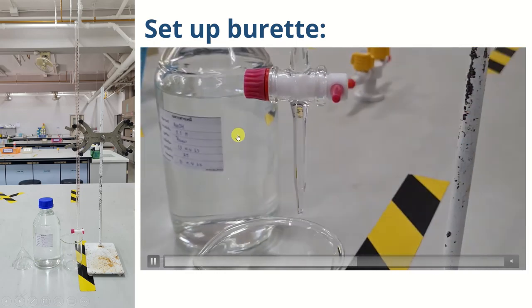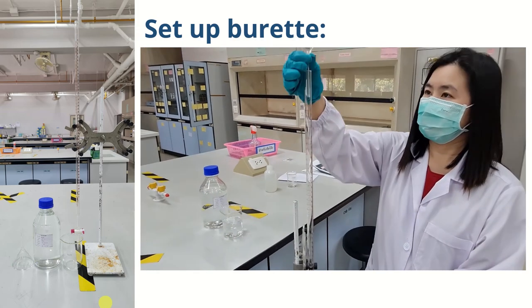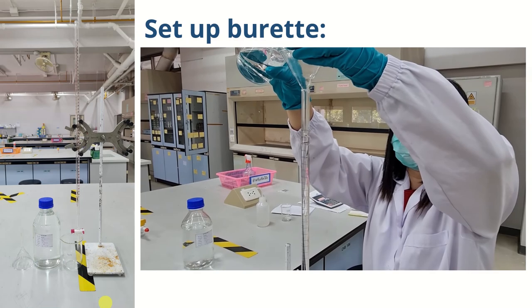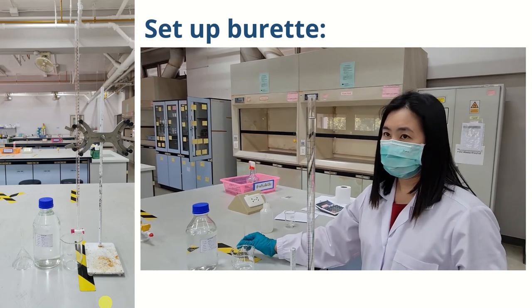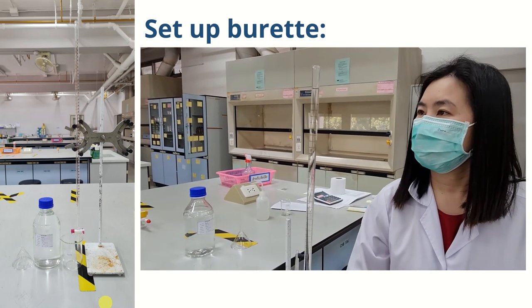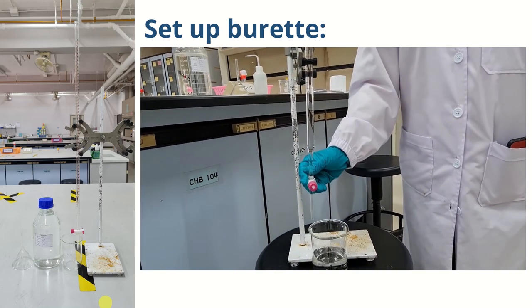When everything is done, you will add more sodium hydroxide. This time you can add it up to the top or to whatever volume you need. And then you're gonna adjust the level to record the initial volume before titration. Always do this at eye level. Eye on the level of solution.